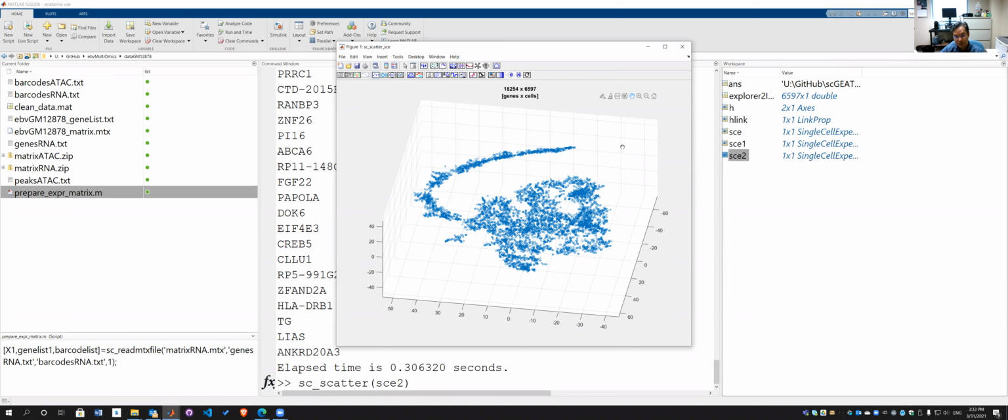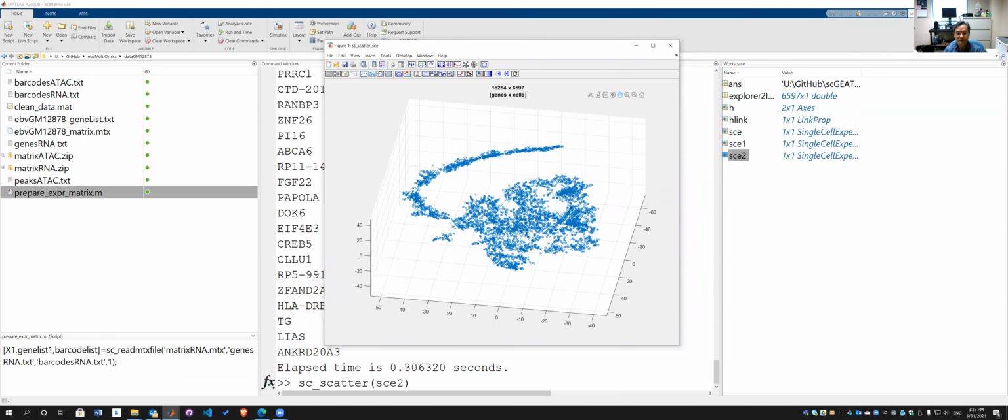So once you are ready, you can annotate them. And again, it's not a guarantee the database will give you the right answer. So you have to look at the context of your paper, the system these cells have been generated from. And then I showed you how to save the annotation into a new variable name. So you can save this into the file later. Don't lose it, because you put your efforts in annotation and you don't want to shut down, close the window, and then the annotation information gone. It's not what you want. You want to keep this to save them for later use.